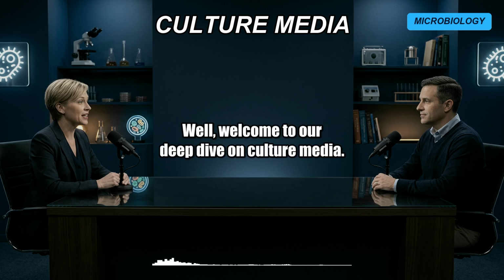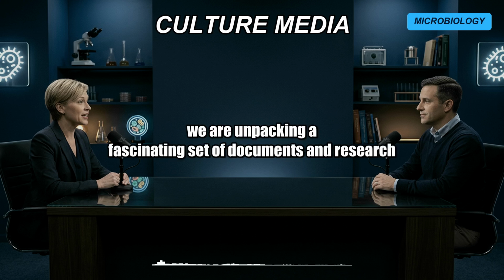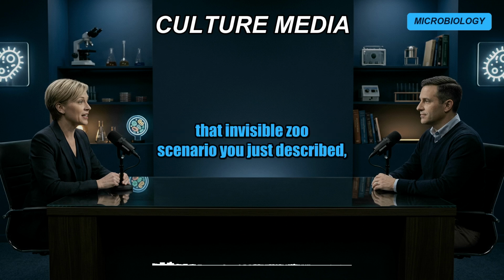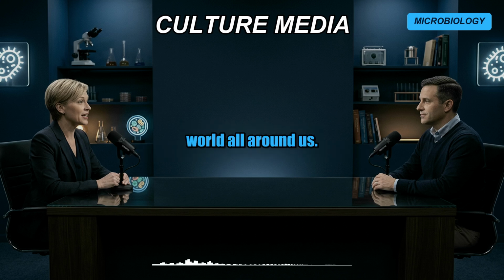Exactly. Well, welcome to our deep dive on culture media. Today, we are unpacking a fascinating set of documents and research notes all about the science of how we feed microbes in the lab. Yeah, and for over a century, that invisible zoo scenario you just described is basically how scientists had to study the microscopic world all around us.